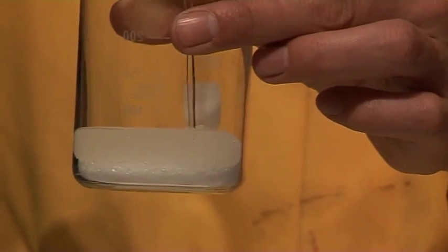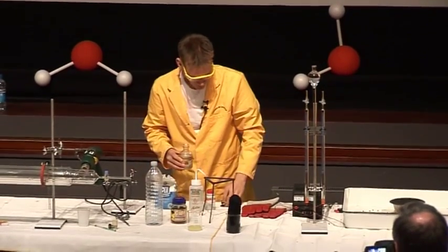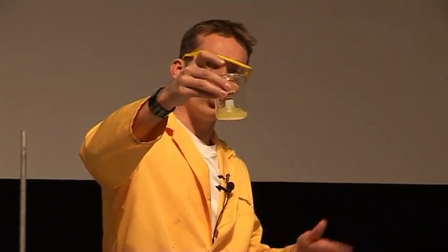This is a bit of a slow reaction, this is one that we need to keep an eye on during the course of the lecture. We can already see that the sugar has gone a sort of a yellowy colour — this is much the same way as when you're heating up some sugar, it caramelises.